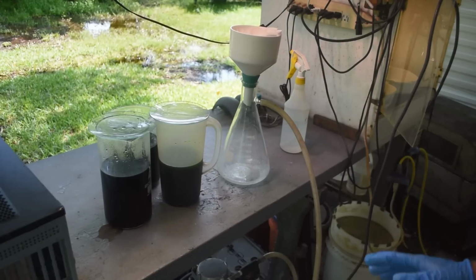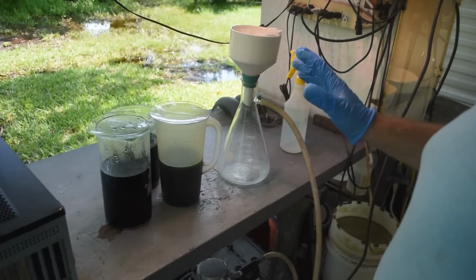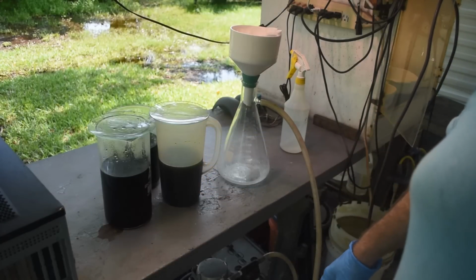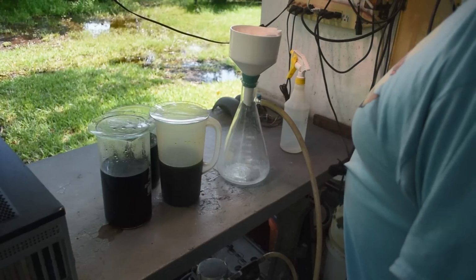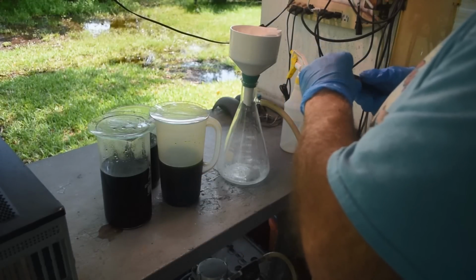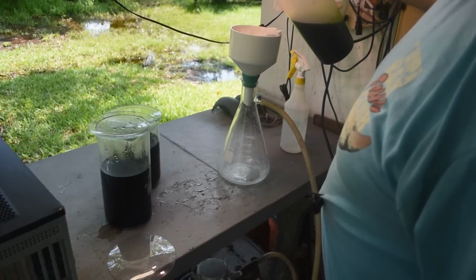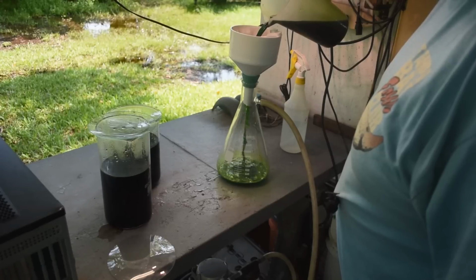Okay, so I'm going to filter these liquids and get any remaining solids out of them. Both stuff that has come out of solution again, and stuff that was left in there from my pour filtration of the stuff after the poor man's aqua regia. So I'm just going to get this stuff all good and cleaned up, and then we will work on dropping the palladium out of it. So I'm going to filter it and then portion it back out amongst my beakers once it's good and clean.